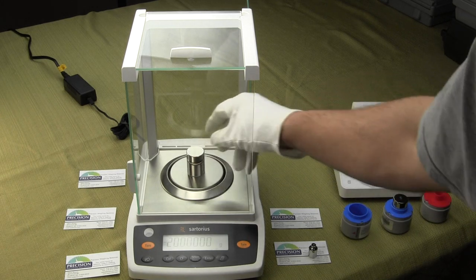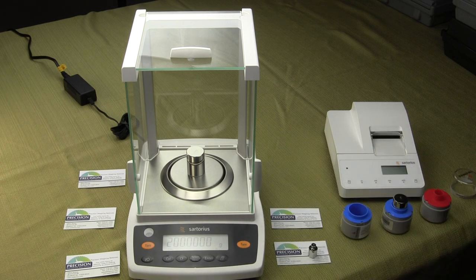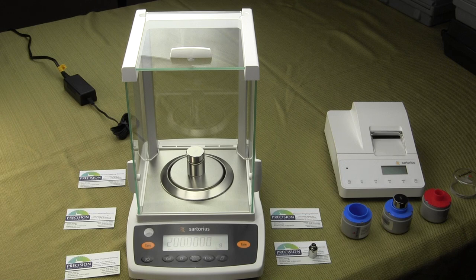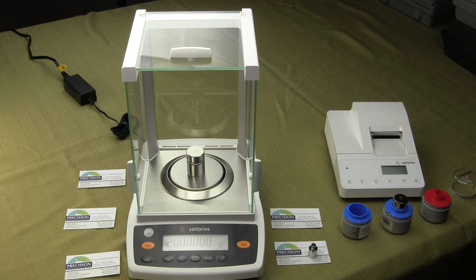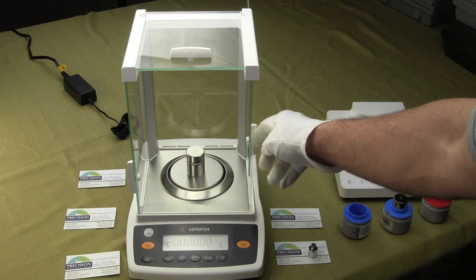You always want to wear a glove so that oil from your fingers does not touch the weight and change the tolerance. You also always want to close the door. You'll notice the balance says 200, CAL is in the lower left-hand corner. In a minute, the balance will confirm the calibration. It says CAL N, calibration is complete. That's how simple it is to do a calibration on this balance.